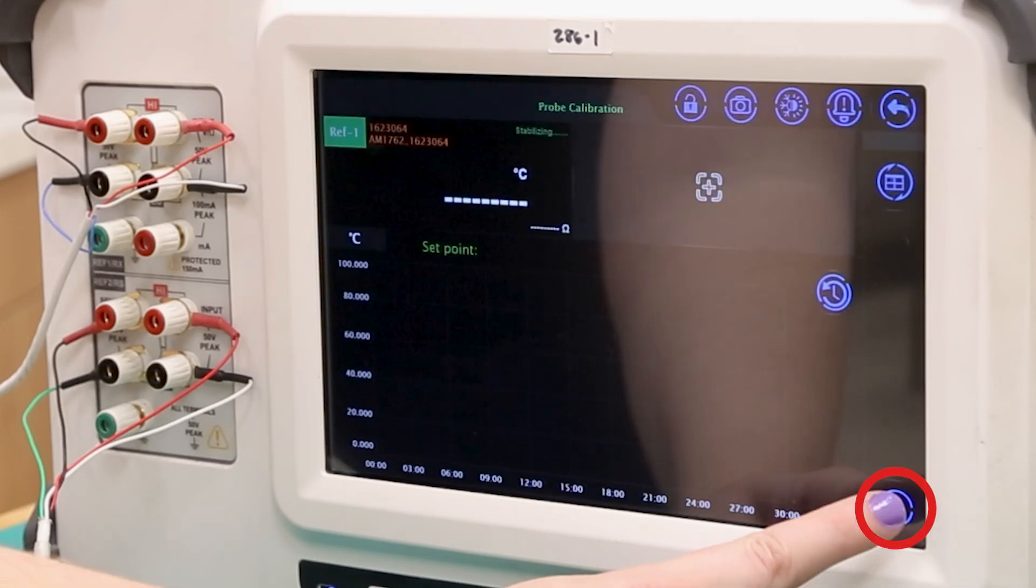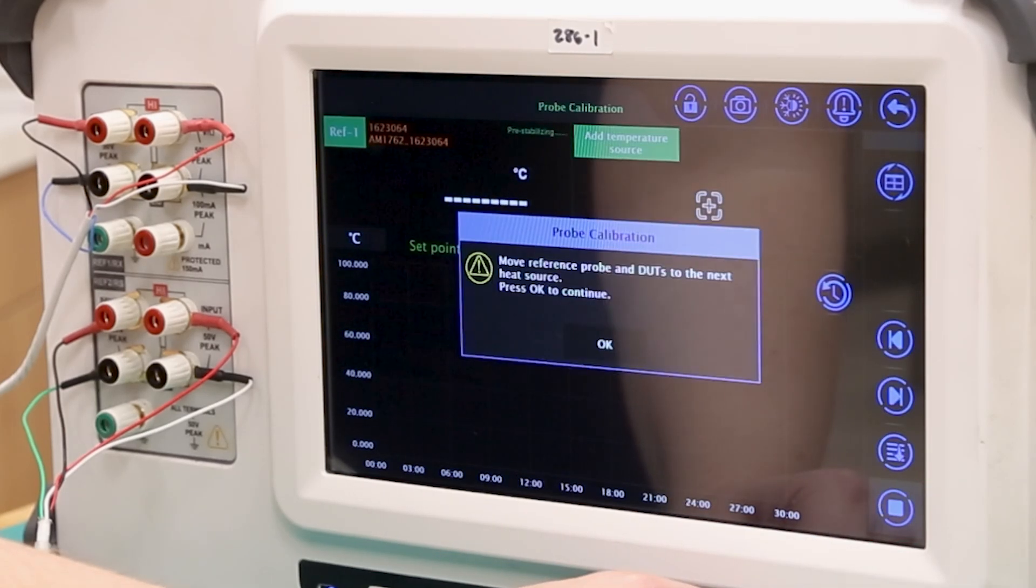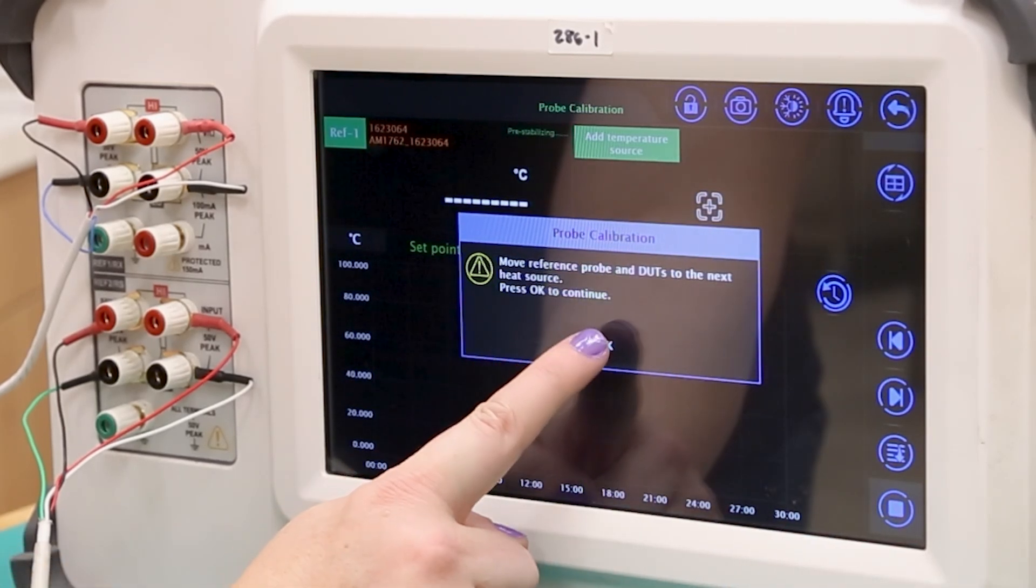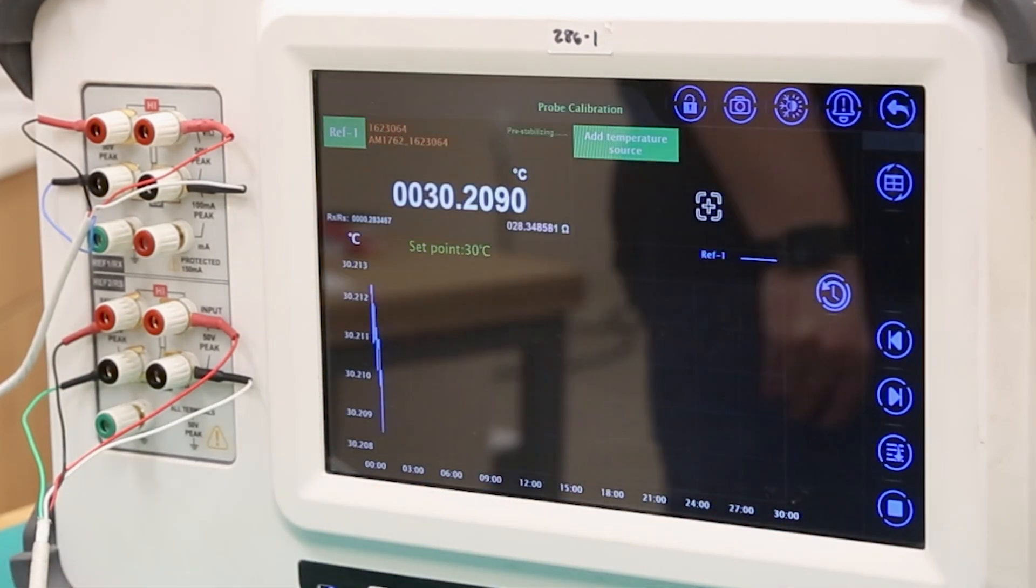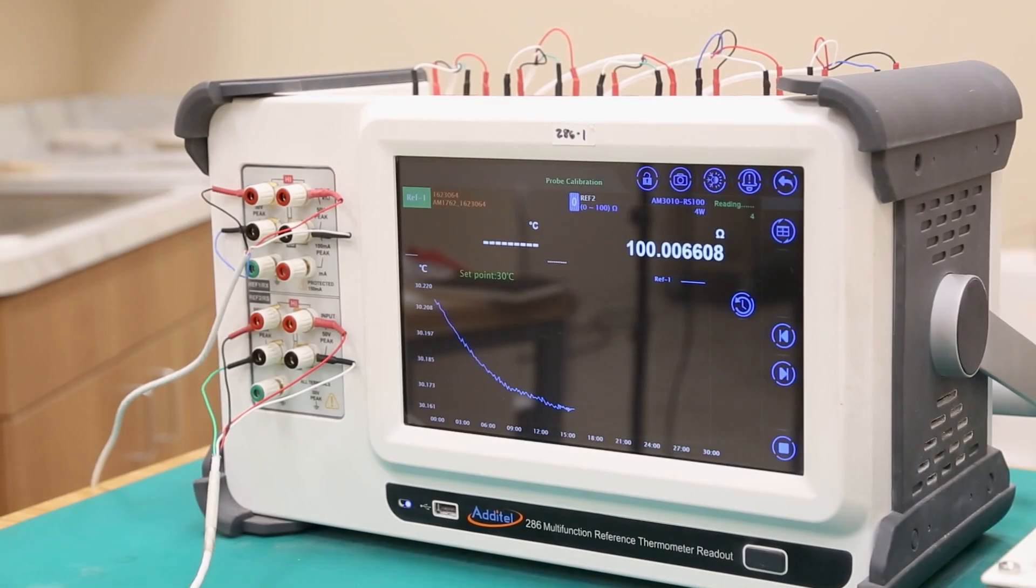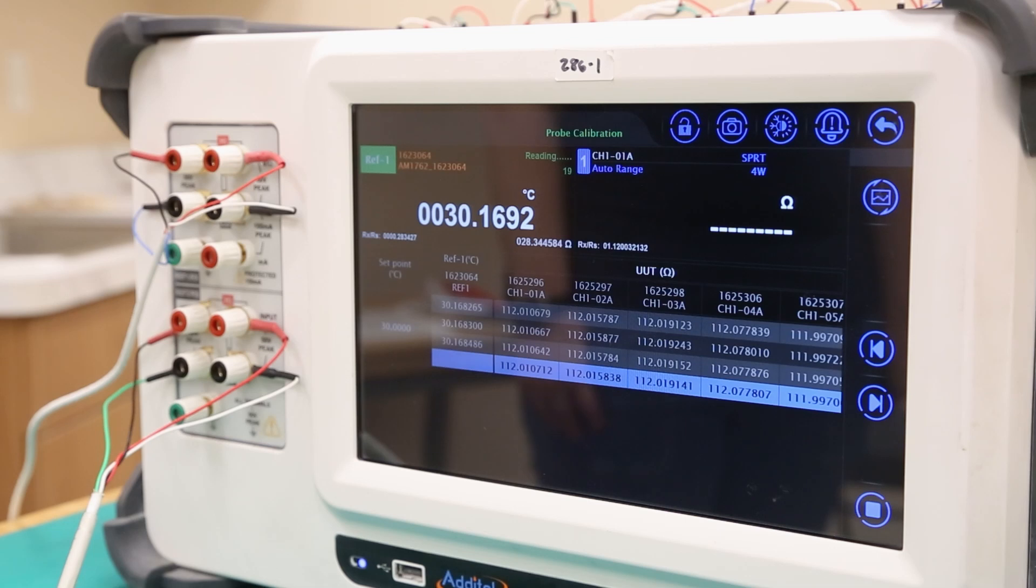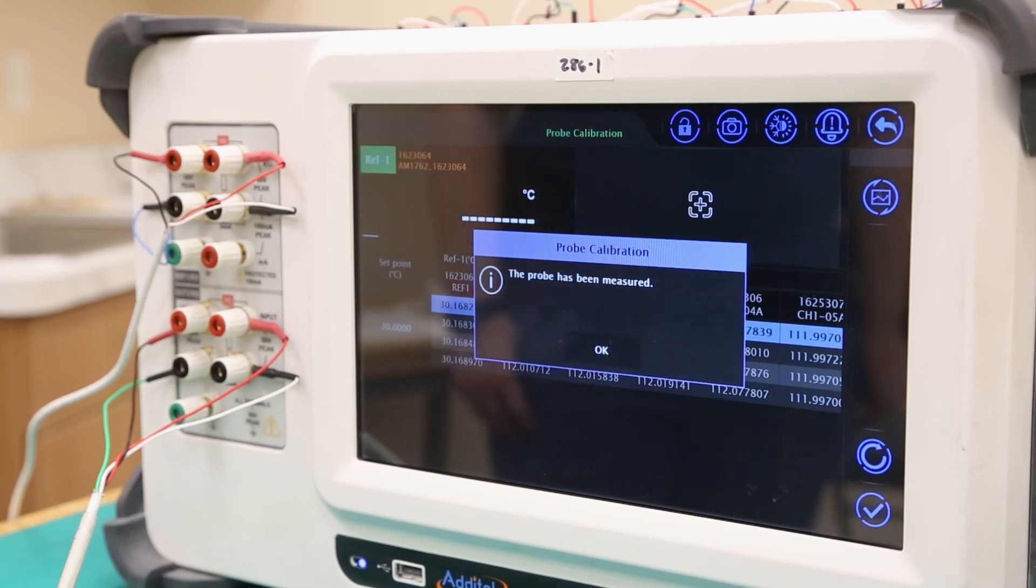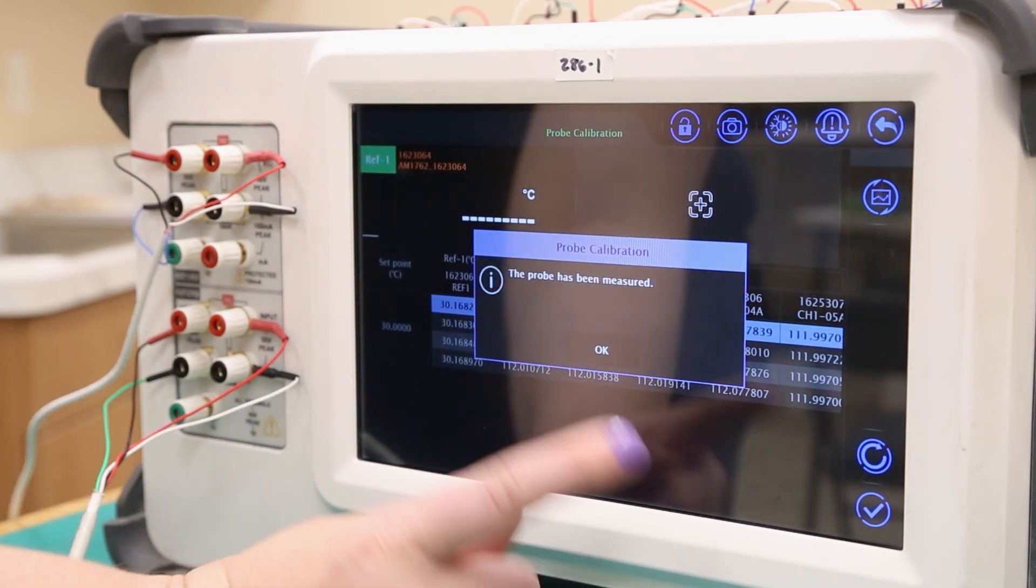Once you select the play button in the bottom right corner, the test will begin. After a brief temperature stabilization period, the 286 will move forward with the comparison measurement of each DUT against the reference probe. This portion of the test is fully automated, and will end with a pop-up window once all probes have been measured according to the test settings.